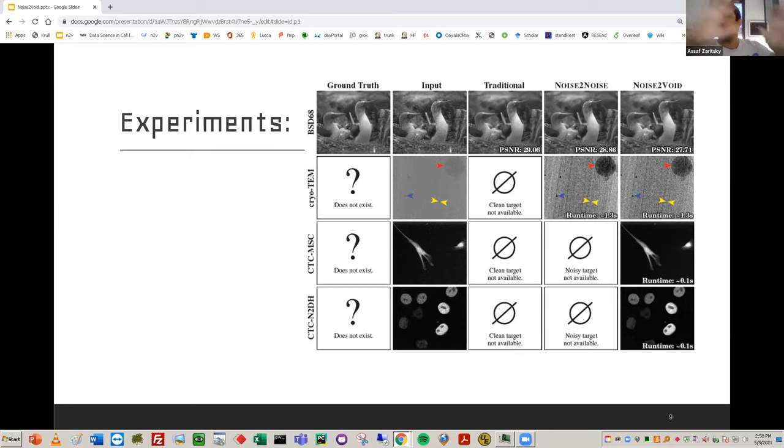In actuality, I think this assumption makes a lot of sense, because in the same image you have things that are closer and things that are more distant. In microscopy, it's not clear, and there is a group of undergraduates in the lab who are trying to play with that. Actually, in microscopy there is a chance that it will work better than on natural images from the world, because the shapes and the structures are pretty simple.